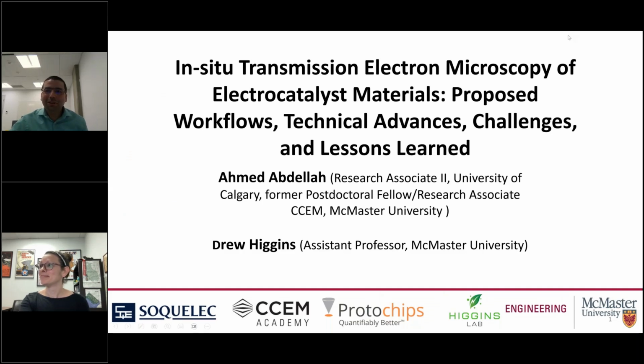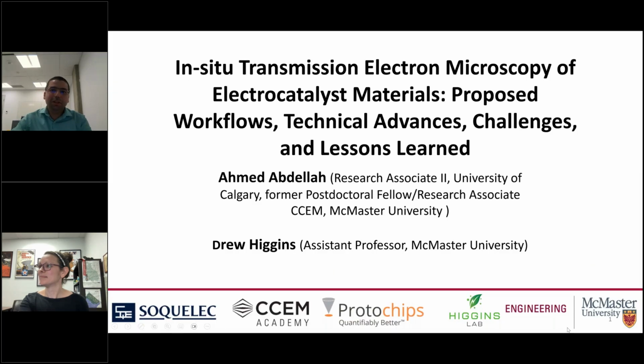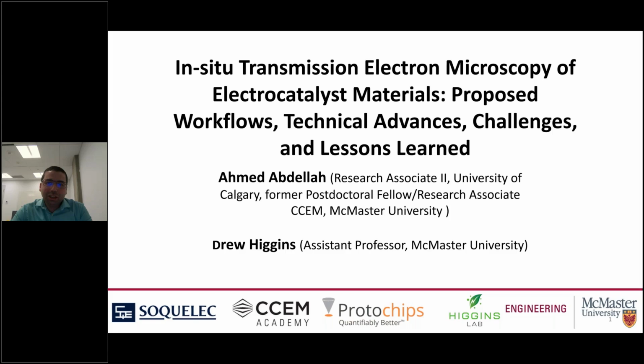Okay. So today I will present my work on in situ electron microscopy: the workflow, the technical challenges, and the lessons we learned. During my PhD I worked with the in situ liquid cell, and in my postdoc I worked with the gas cell. So I will present some of my PhD work, which I did at McMaster University in the Canadian Centre for Electron Microscopy.